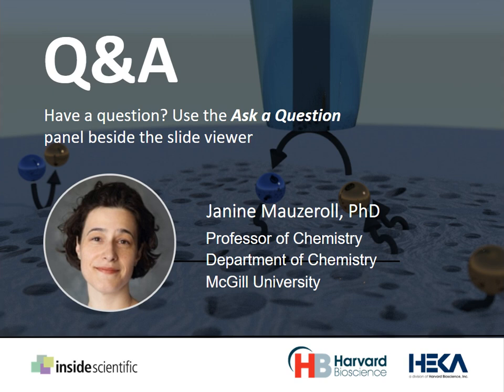So when you start the design of your experiment, let's say you're going to carry out a reduction of oxygen and you're using a reporter molecule, well, maybe hexaamine ruthenium chloride isn't the best choice because it could overlap with it.